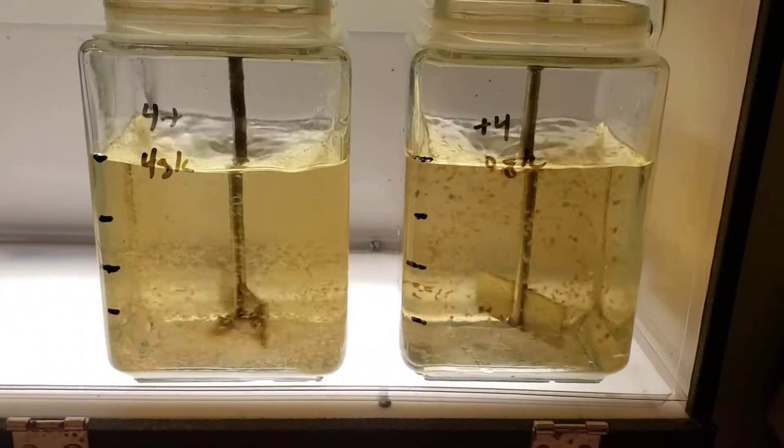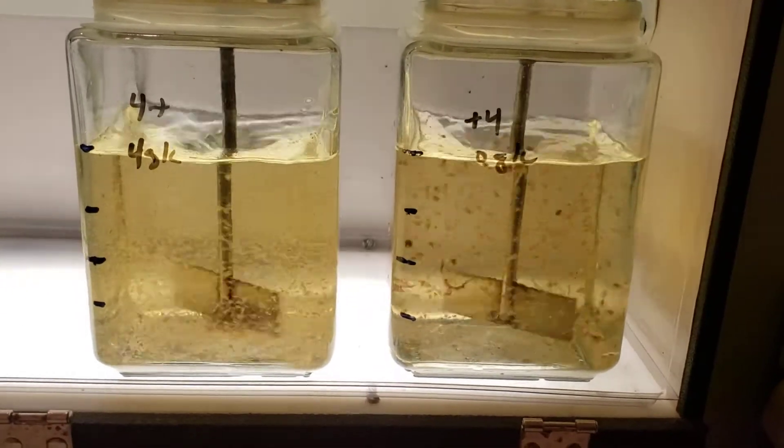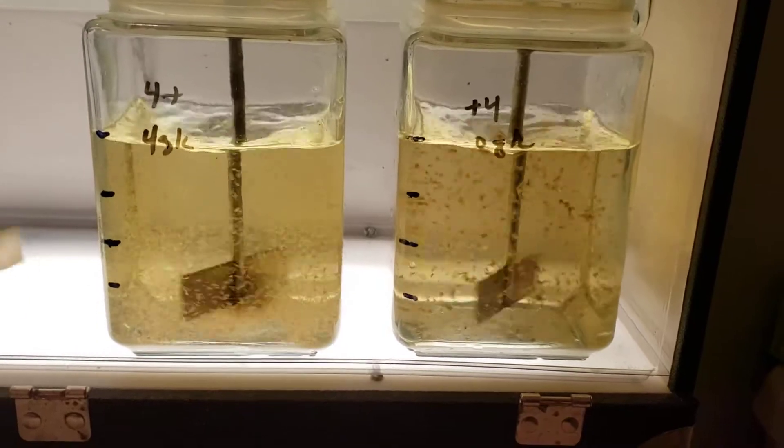The jar on the left has four grams of sand; the jar on the right has no sand. They both have the same amount of flocculant: 4 ppm.